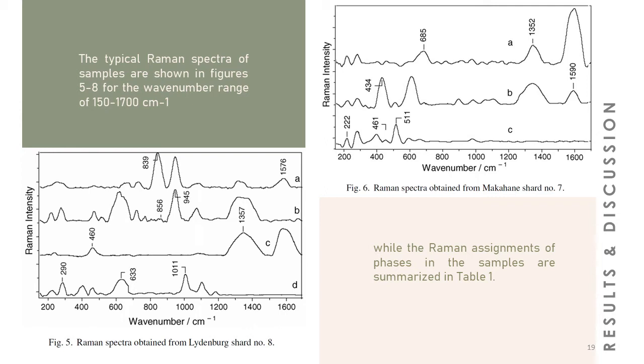Considerable amounts of hematite, quartz, feldspar, kaolin, montmorillonite, illite, and calcium silicate can be observed through this data.